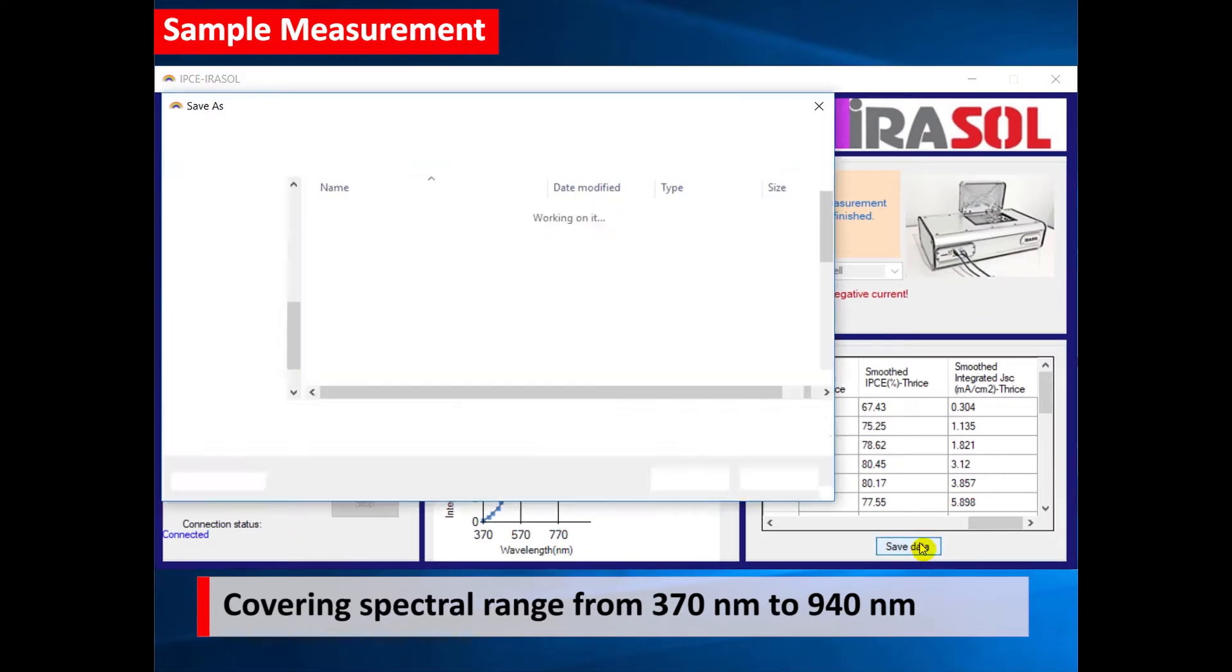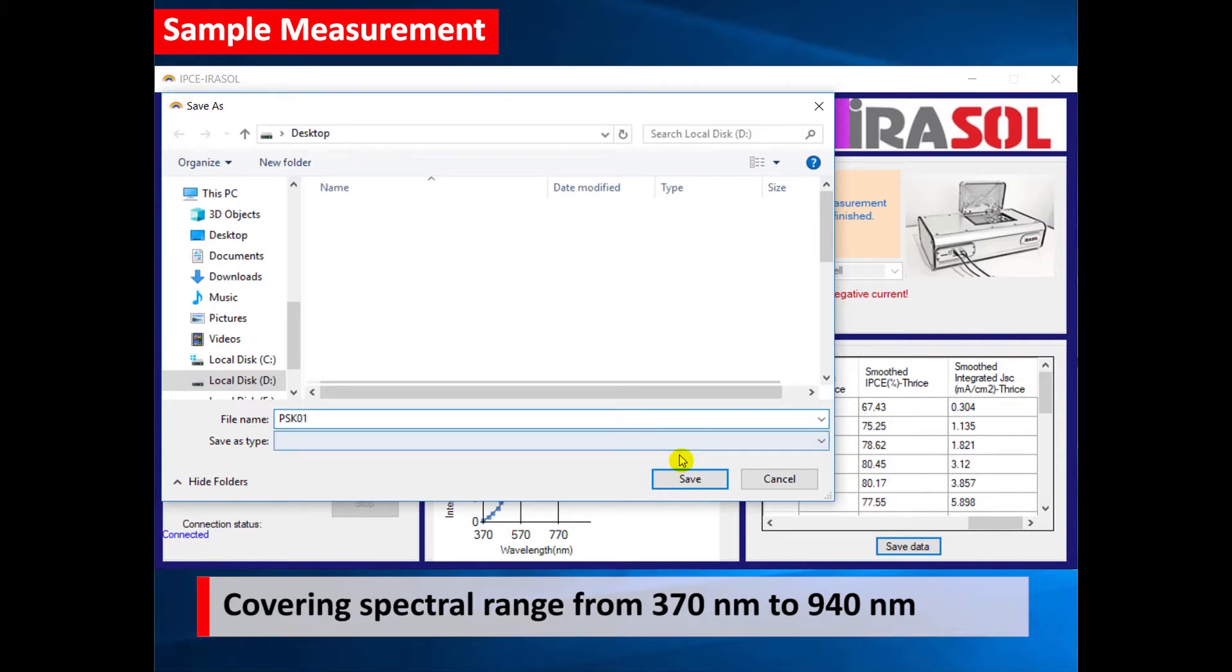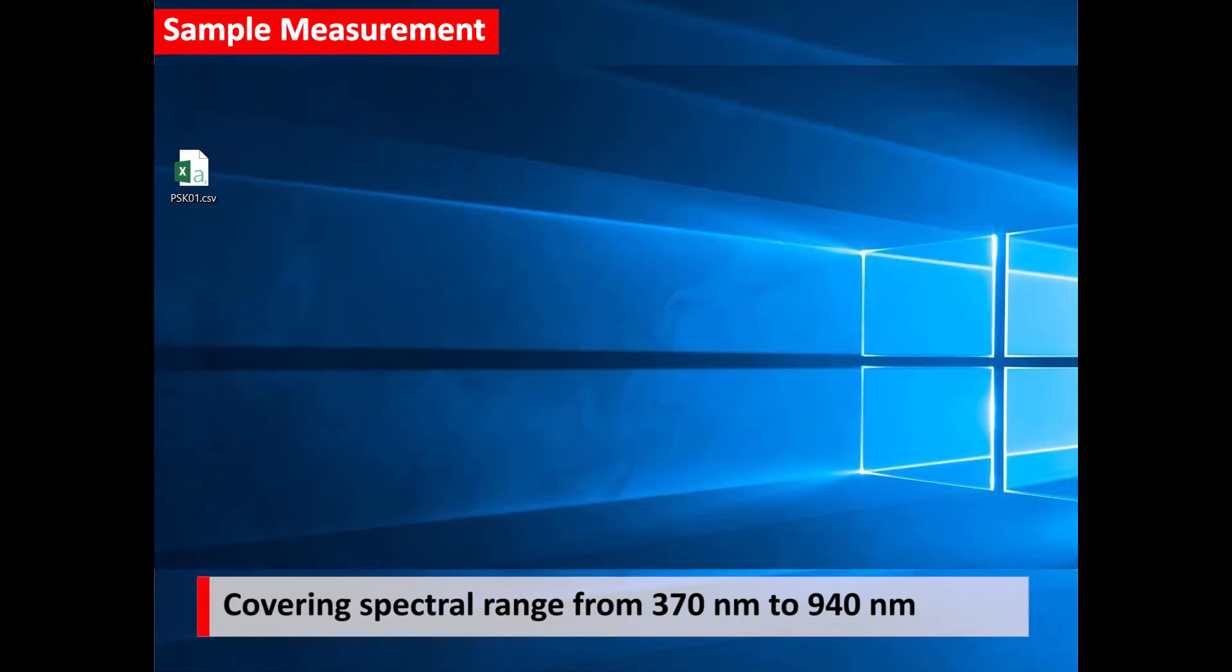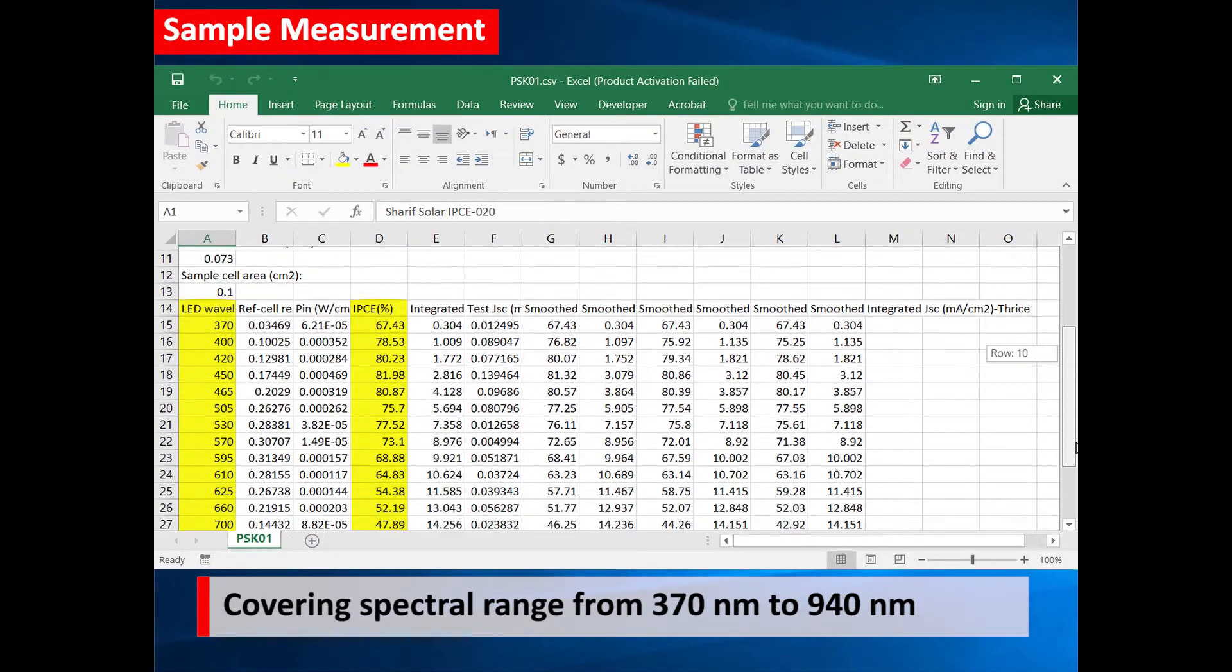By clicking on save data, the whole data table can be exported into a CSV format. The file can be later opened in Excel for more processing and plotting.